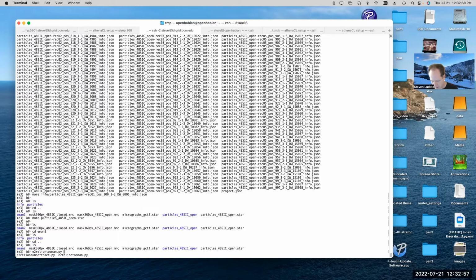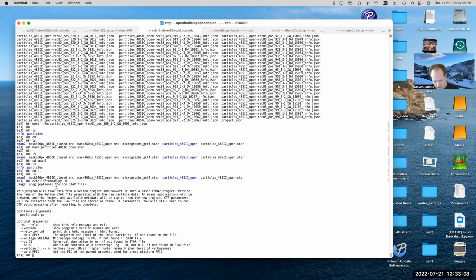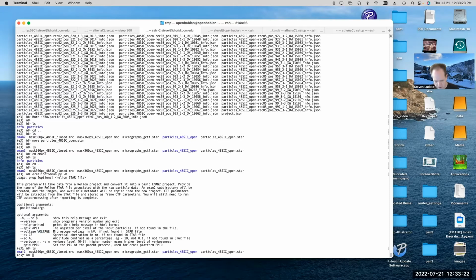You could run that on a star file, and it would create a folder called EMAN2, and that's exactly how I created this. If we say help here, you can see you basically just give it the name of the star file. And if you want to override any of the values in the star file, like the angstrom per pixel value or the voltage, there's a few other parameters you can specify, but otherwise it'll just read the star file and create this EMAN2 folder along with all the metadata.